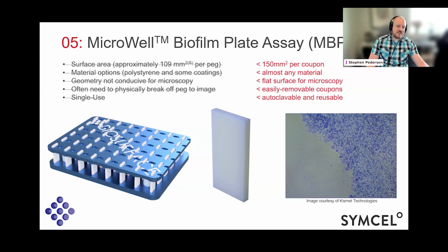And this entire device is made, other than the coupons themselves, the entire device is made out of autoclavable materials. So the whole thing is reusable over and over and over again. The coupon material, a lot of them will also be reusable and autoclavable. It just depends on what the material is that you're studying.